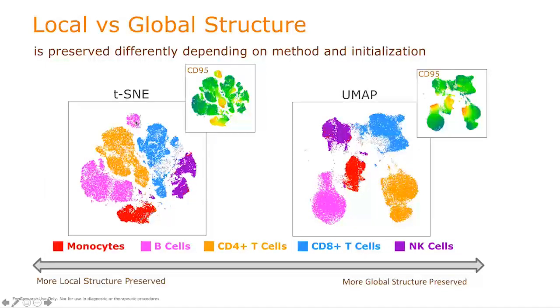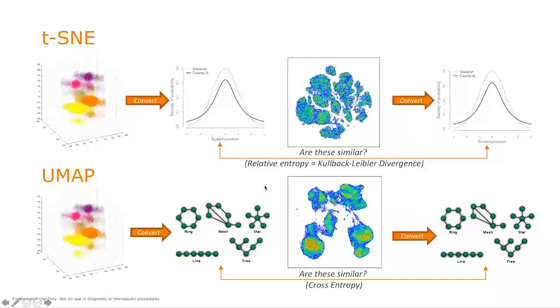And so you can't say that because this is closer to the 8s than it is to the Bs, that it's more closely related there. You can't make that inference. UMAP, however, keeps the global structure preserved, and it does not have the same type of fracturing of lineage islands into multiple islands in different locations here. And so you can actually make some inference here that if the cells are closer to each other, that they're more closely related. So that's just global versus local structure.